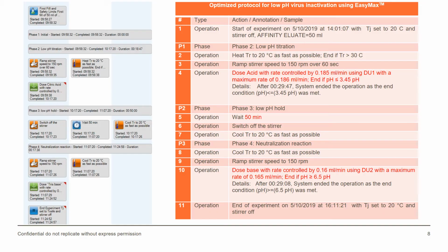All of the steps are automated, so you program this in at the start of the experiment, and you can literally walk away and let the system do its thing. Using this setup, we were able to complete the entire DOE within a set of 2 days.